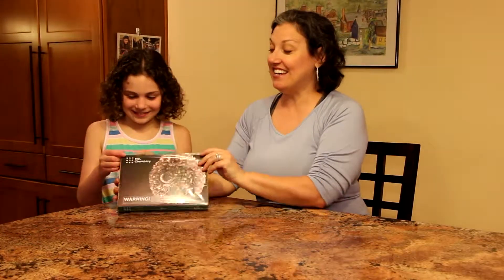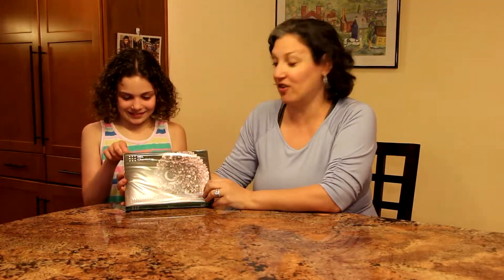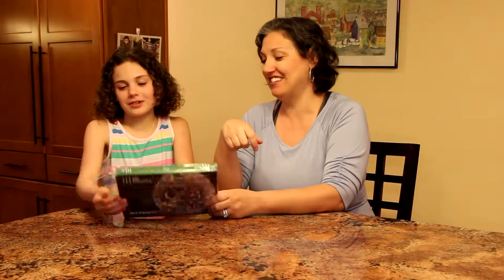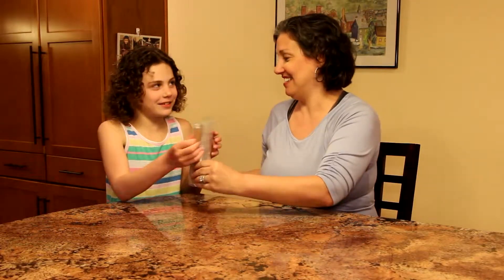Here is the first lab that comes with the starter kit — the Tin Lab. You can open it. Look at what the age recommendation is for this. I just turned 10! I know, isn't that awesome? My brother is not allowed to use this for two more years.